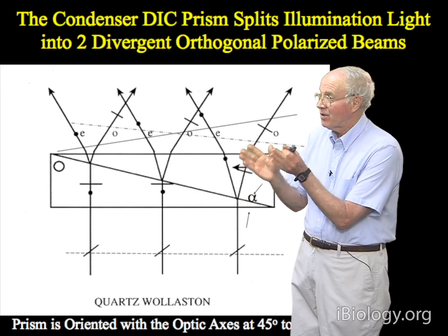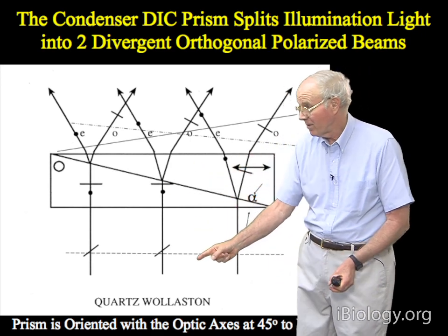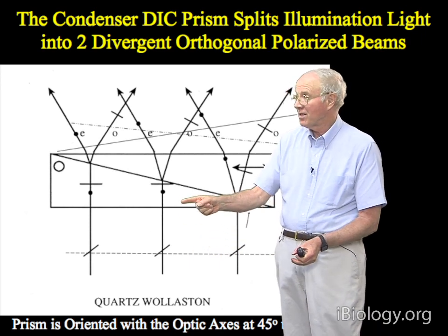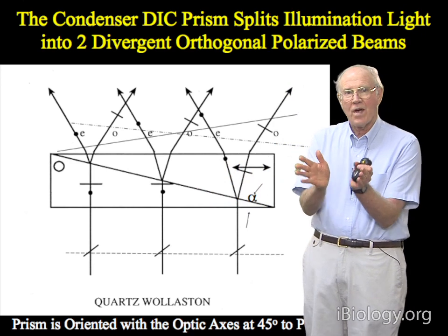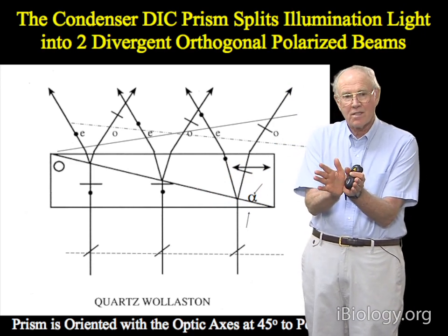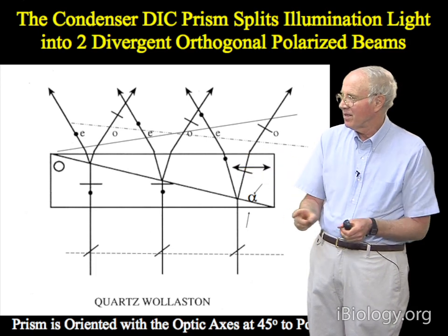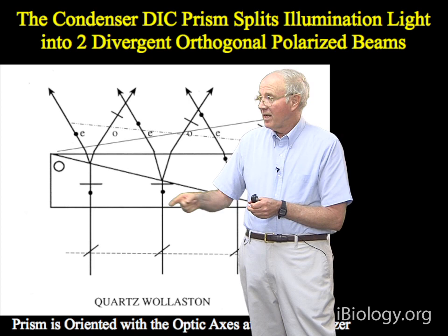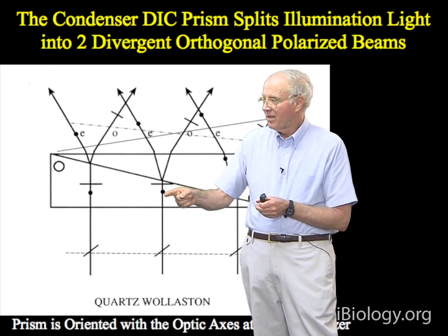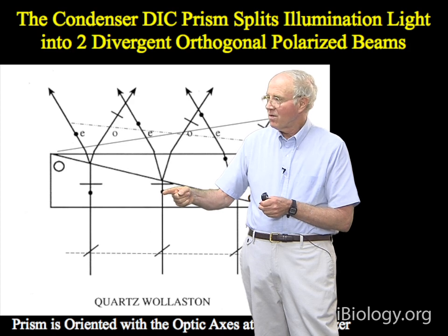So across this wavefront, coming from the polarizer, by using this first wedge, we're generating two orthogonally plane polarized light beams, where the electric fields are vibrating in the direction of the crystallographic axes, right? And in the lower wedge, you can see the n sub e one is slow compared to the n sub O one.